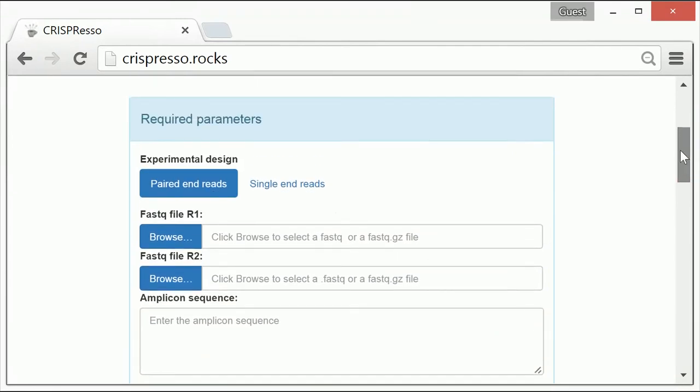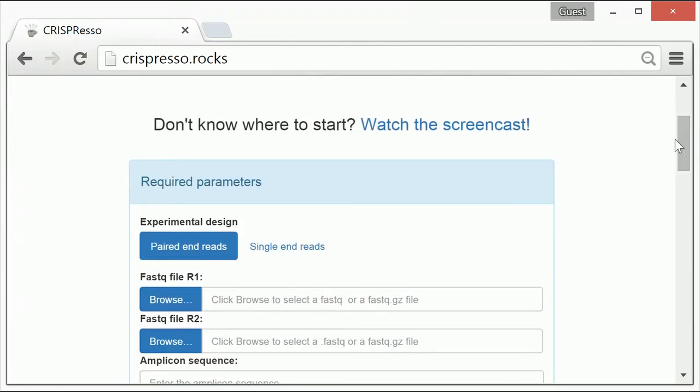Let's start with the required parameters. In order to run CRISPResso, you minimally need three things. The first is to select the type of sequencing data you have, either paired-end or single-end reads.